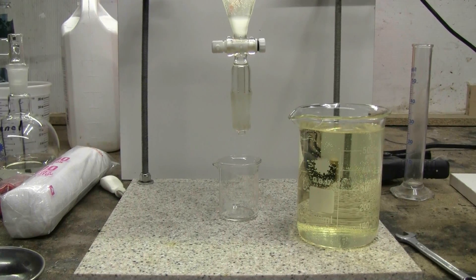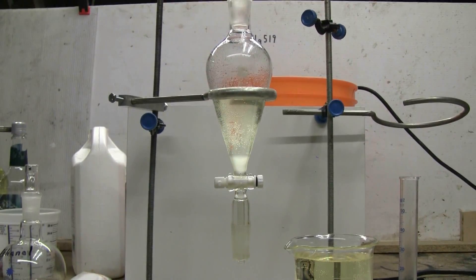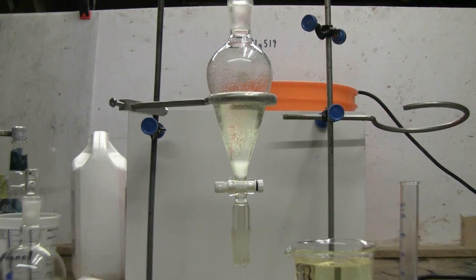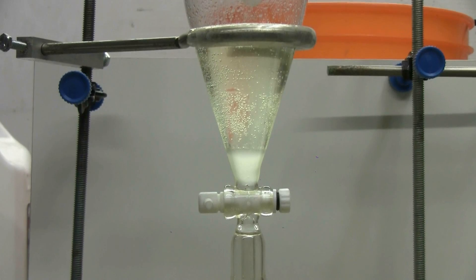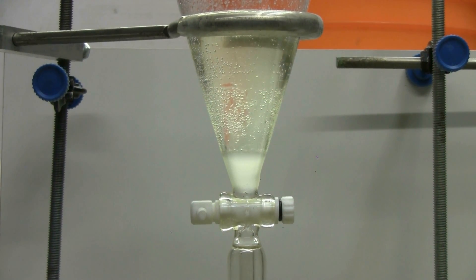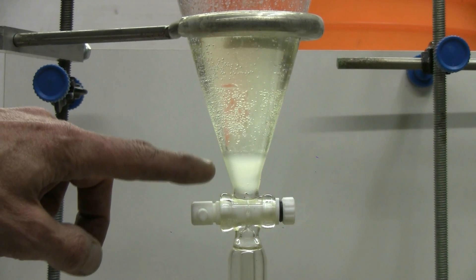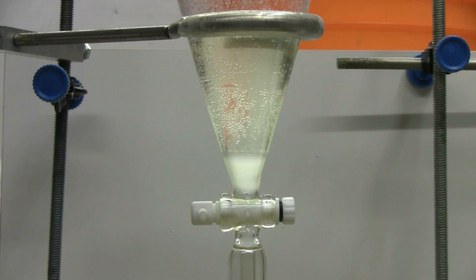I've set up a sep funnel with a small beaker under it and we can see that the balance of the product is in the sep funnel where two layers are forming. Our chloroform will be at the bottom and we'll be able to just drain it off into the little beaker when it finishes separating.